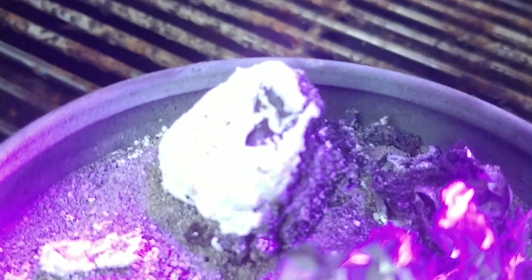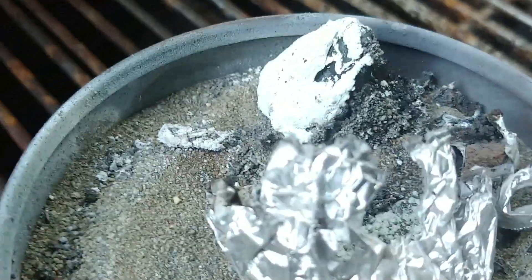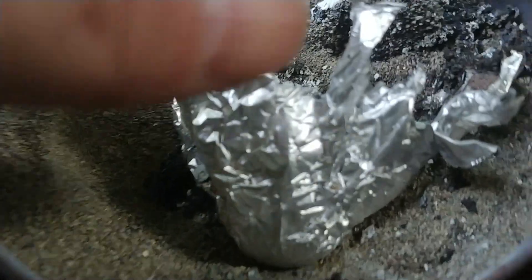That was my hope — to be able to at least get something between the thermite and the oxide material, and that's why I packed it in and made it as dense as I could before placing it.